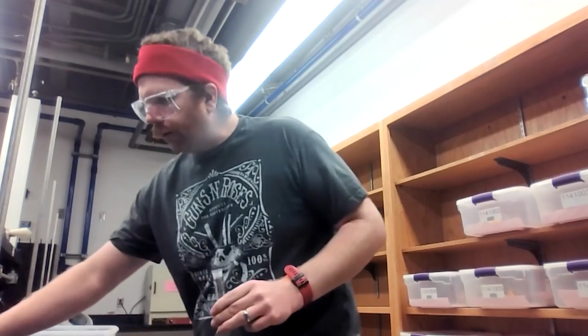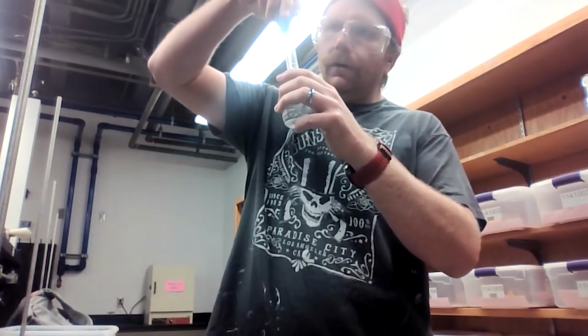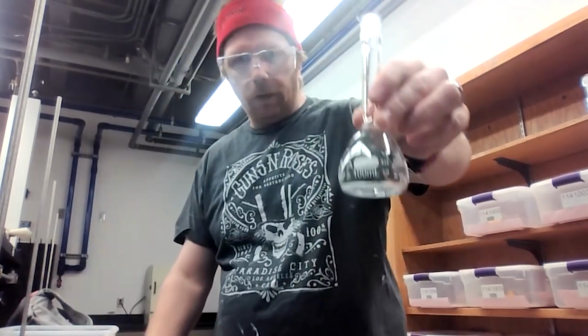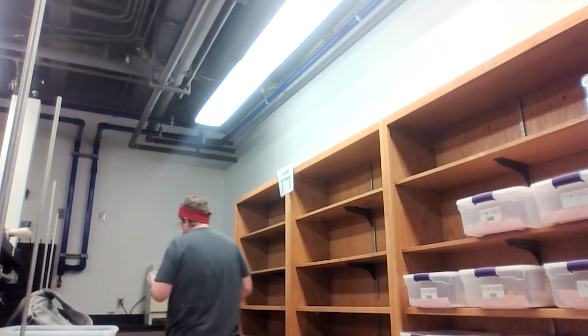Okay, now I'm going to get my weigh boat and transfer my sodium chloride into my volumetric flask. We'll also need on hand more deionized water.